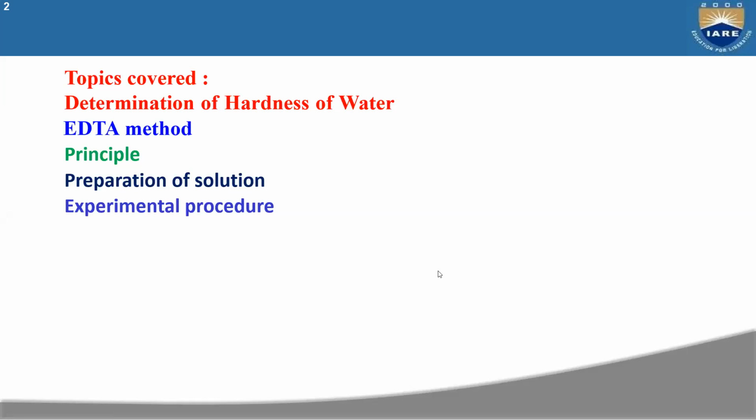You will be able to calculate the total, permanent and temporary hardness of the given water sample. So these are the uses of the EDTA method.